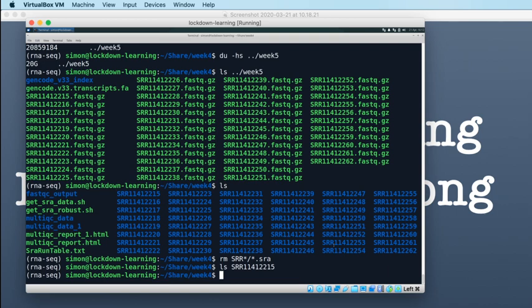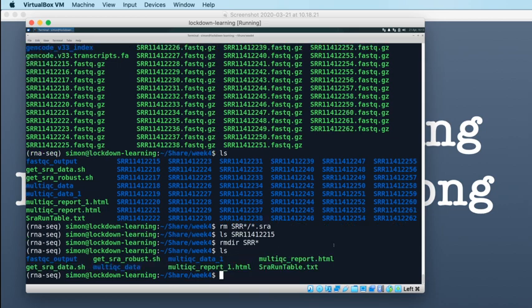So that returned nothing. So the file that was in there has now gone, and that means that we're left with these 48 empty directories. And to remove an empty directory, we can do rmdir. And rmdir is cowardly and will refuse to remove directories with any contents, so we're protecting ourselves against descending into directories and removing all of their contents. And again, we can use the wildcard, so srr and then a star. So those have now gone, and that's freed up 15 gig of disk space.